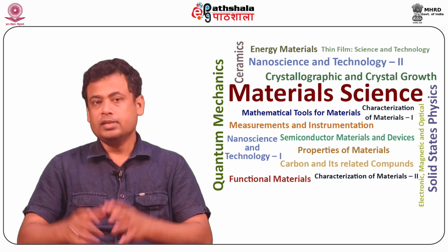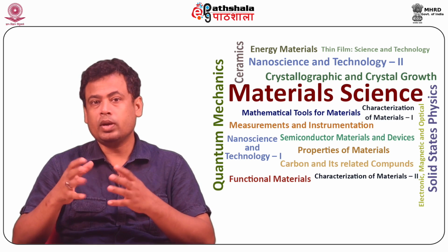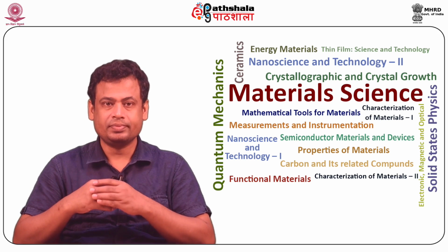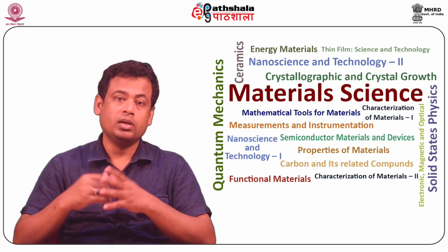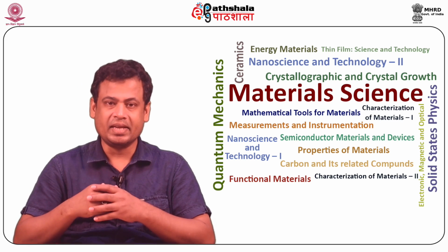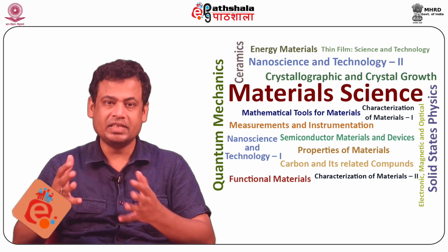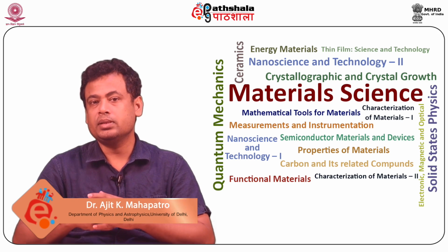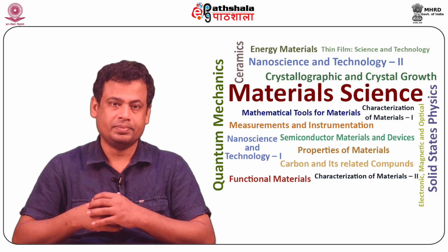So students, let us summarize what we have learned in this module. The introduction, qualitative analysis of XPS spectrum has been discussed. The peak identification, chemical shift in XPS spectrum and issues with insulating materials are discussed with schematic diagram. The quantitative analysis of XPS and sensitivity calculation has been discussed, and the possibility of the depth profile in XPS samples are also studied. Thank you.